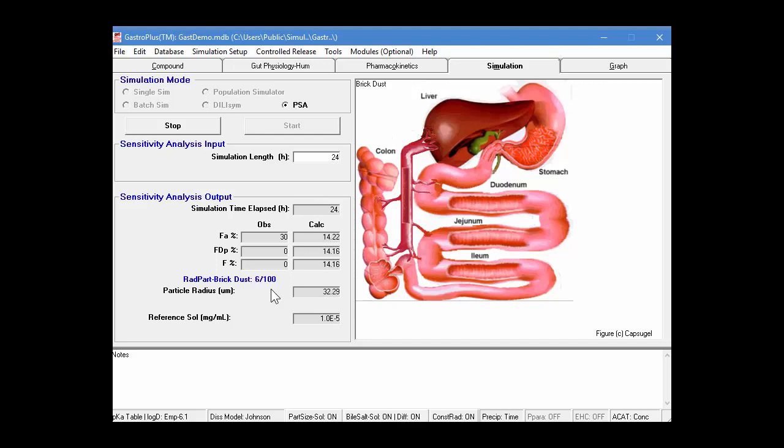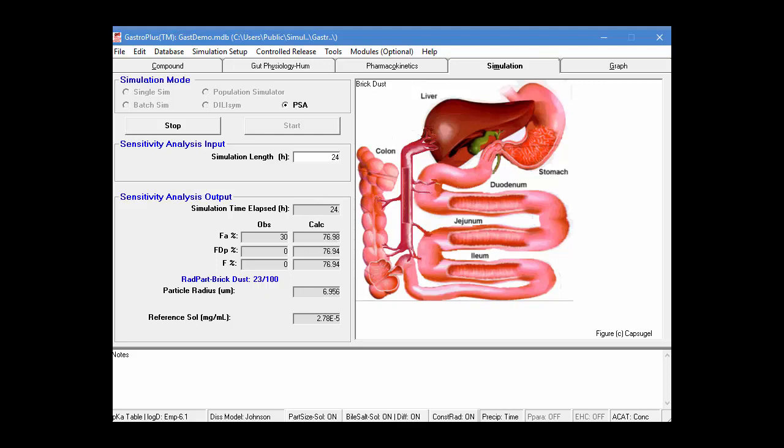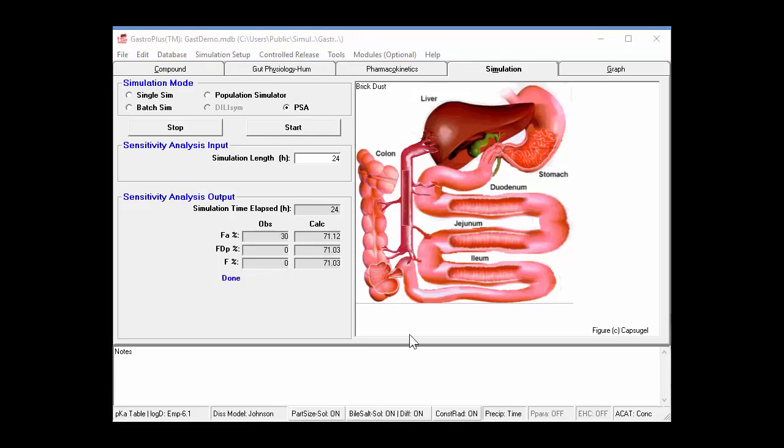So, in the first part, it'll vary the solubility 10 times, keeping the particle radius fixed. Then it will increment the particle radius and then loop over the solubility, for example, again. And so, we'll just let that run. I think it should take just a few minutes on my computer. The simulation is finished now.